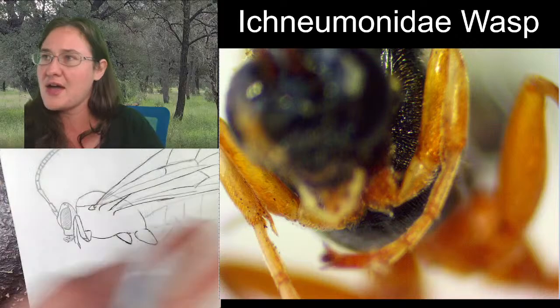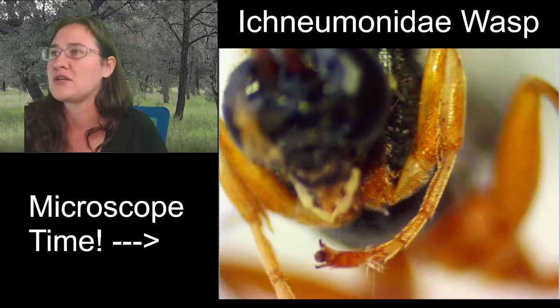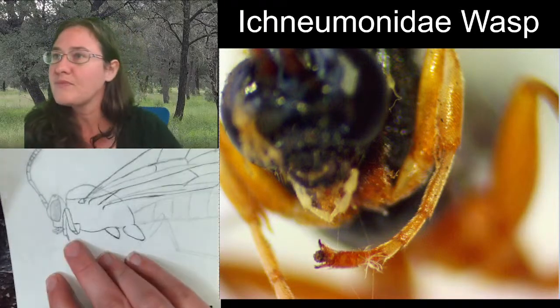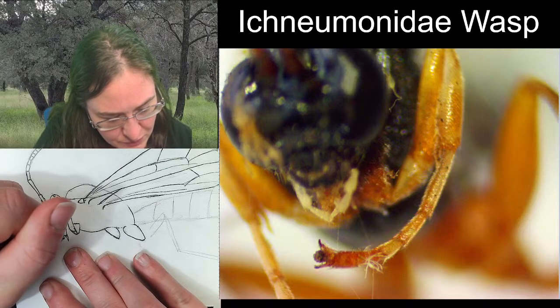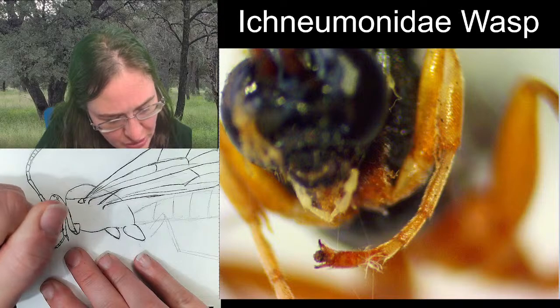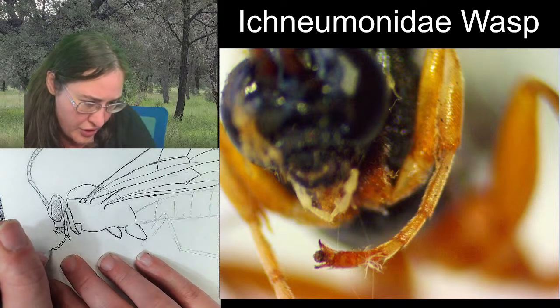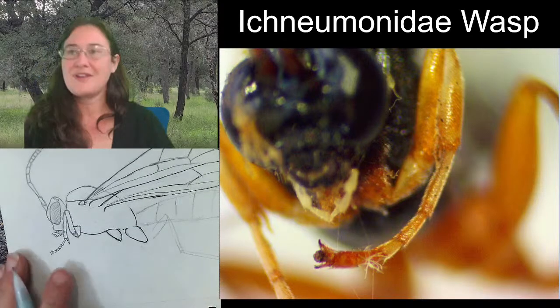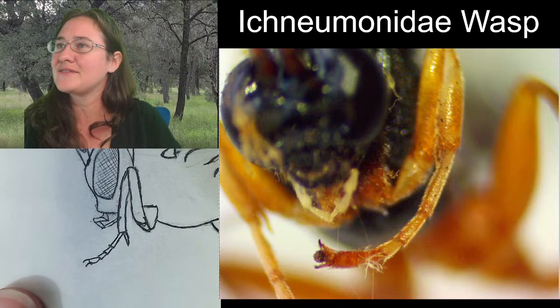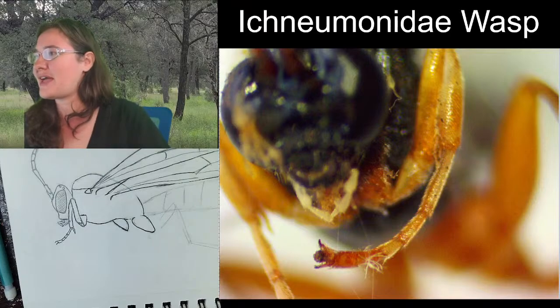And then the tarsi are going to be moving forward. 1, 2, 3, 4. And the tarsal claws. And that's our front leg. All right, we are going to be moving all the way to our middle leg.